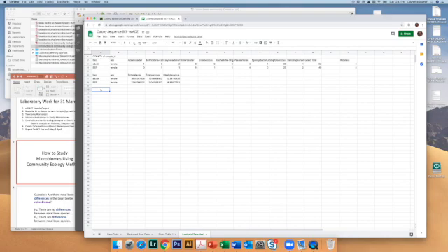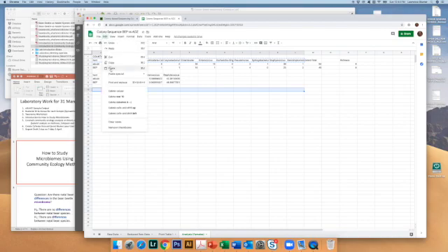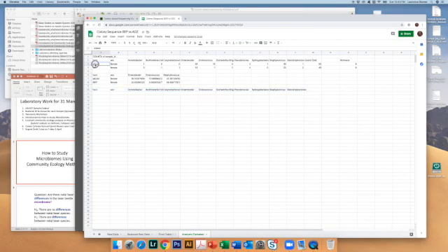Okay, the next thing is we can calculate some diversity indices to see whether those are different between the colonies that came from adzuki beans and black-eyed peas. Again, the way to do this is to start out by grabbing all of the column labels except the grand totals. So for the actual data, I'm simply copying that, and then I'm going to paste it down here. Whoops, that's too much. There we go. And then I'll give a paste command. There we go. And then I want to get the row labels. So I'm giving a copy command and then a paste command.